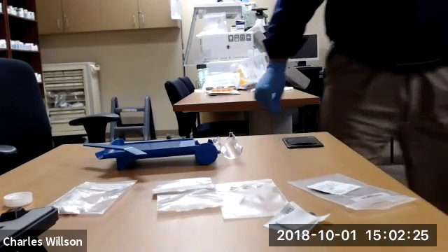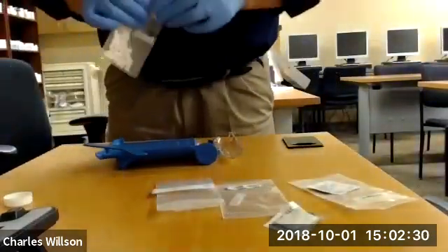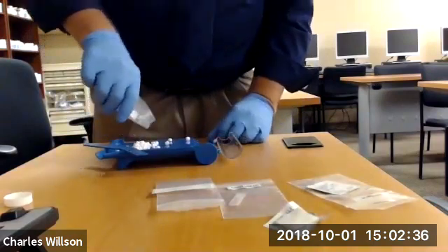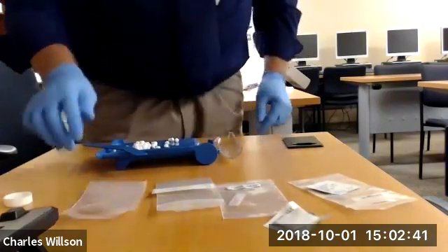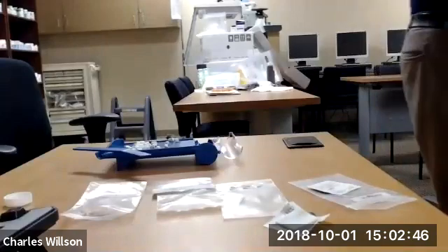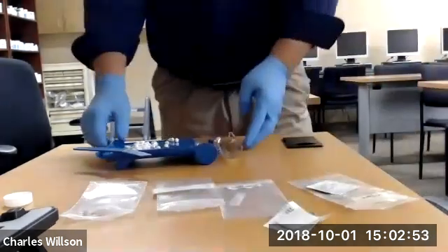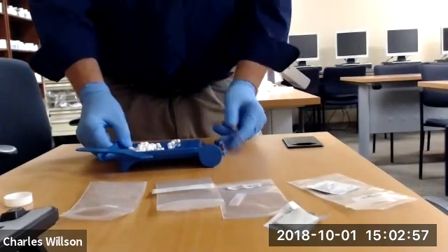All right, now we're going to put all of our tablets onto the tray. And that will happen, but I'm wearing gloves so I can pick them up. Okay, fine. All right, so there, we've put all our tablets onto the counting tray. Okay, yeah. It says open the window covering the counting tray tube. That's this. Okay, so do that.